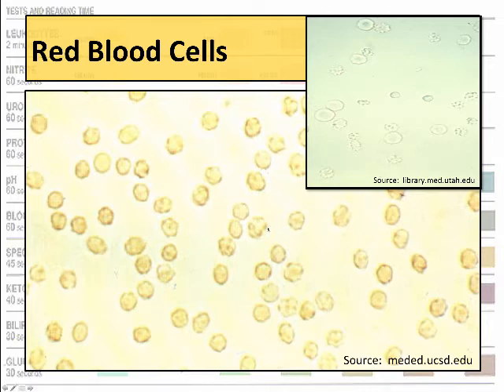What you might notice, depending on the urine sample, is that the shape of the red blood cell might change. For example, if you look up here, these little red blood cells that look shrunken are indeed shrunken, and we call them crenated. And that is because the urine that they're in is very concentrated. It's very hypertonic, so the water has left them and kind of caused them to shrivel up. Not uncommon to see them. Make sure you know that when you see something like this, it's a red blood cell.